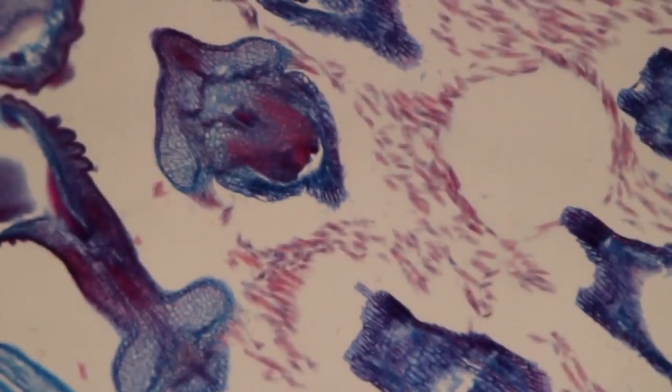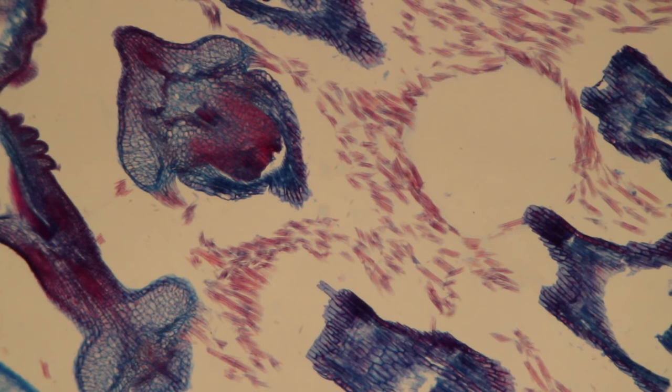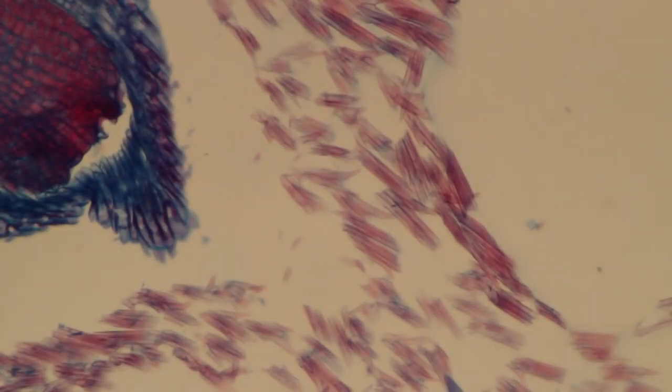This new slide is a cross section of a flower. When the next slide is moved into position we are using the 4x objective and the whole procedure starts again. You can use the coarse focus knob to focus the specimen, then move the next objective into place and refocus, then the next objective and refocus again.